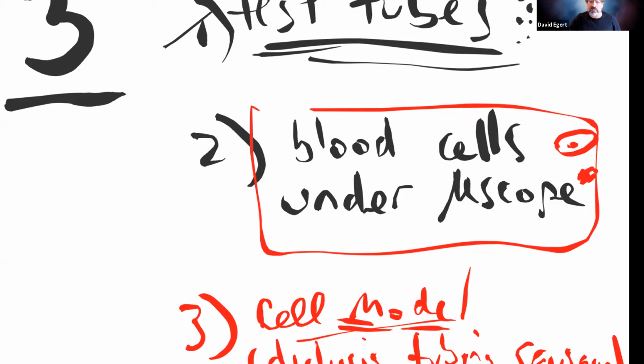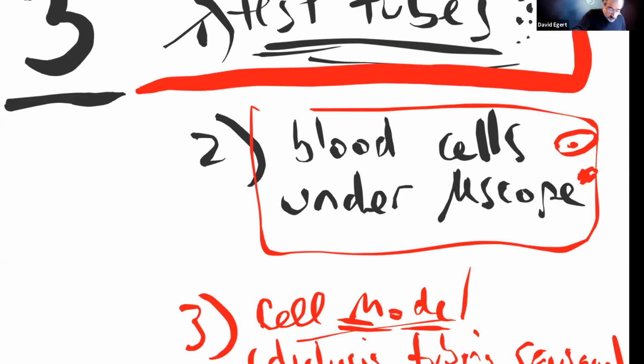Again, another level of hopefully intuition about hypotonic, hypertonic, isotonic, because those concepts are really deep in our class. And I really want you to just keep seeing it again and again and get this intuitive feel for it. So we'll start with the test tubes.